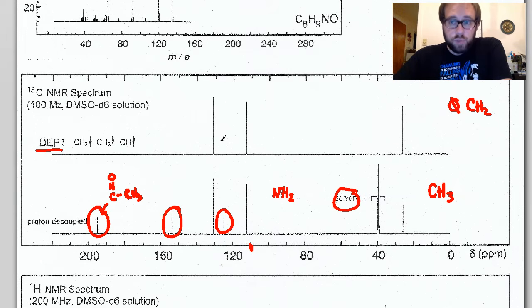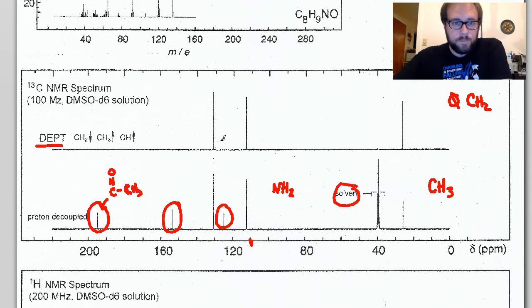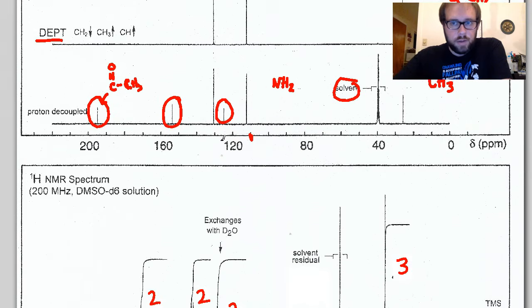So this brings some pretty good information into the fold. We have an aromatic ring most definitely based on the carbon 13. We don't have any CH2s. We do have a methyl. We do have a ketone most likely. And we do have a di-substituted aromatic ring. We'll confirm if it's para using the Proton NMR in a second here. So speaking of which, let's go down to the Proton NMR.